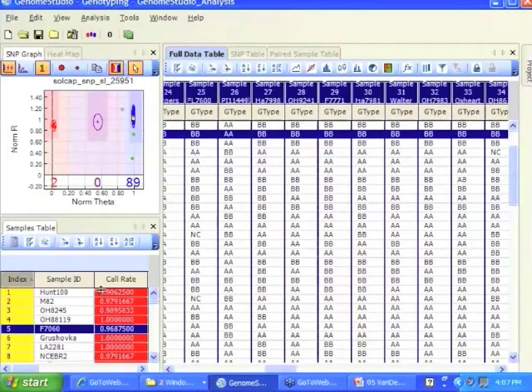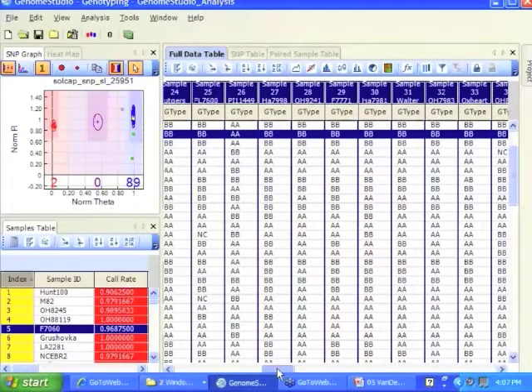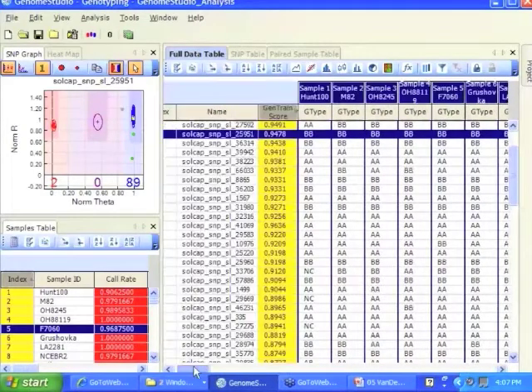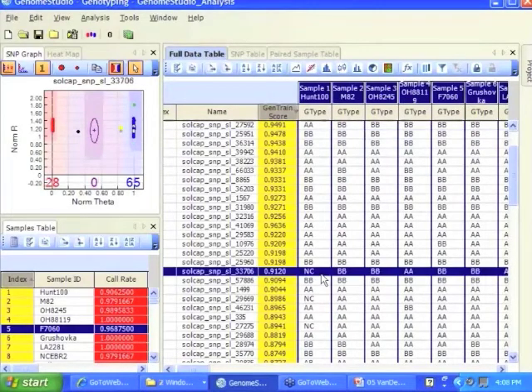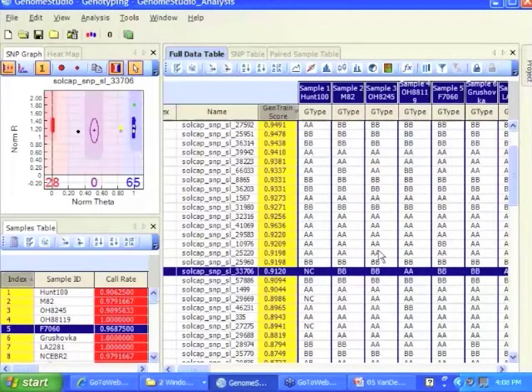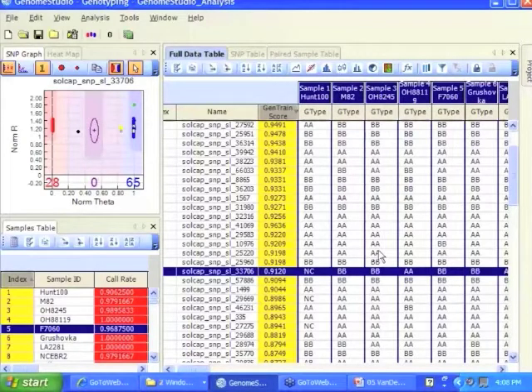If I exclude samples here, let's see if I can find an excluded sample, or example, here's a no call, the NC, so the black dots, that means a no call. So it will tell you, no, I'm not calling that one.